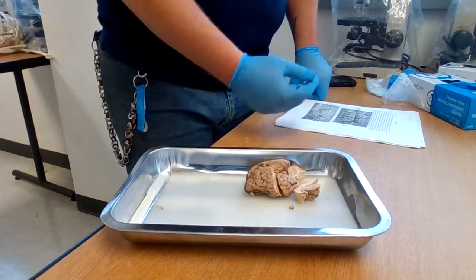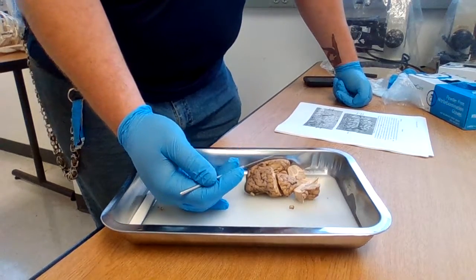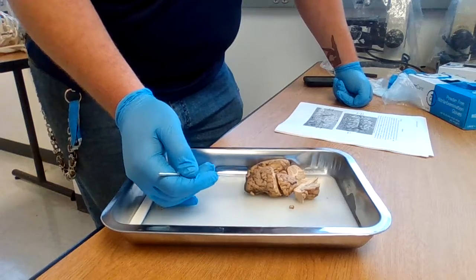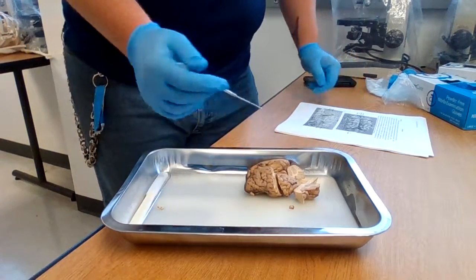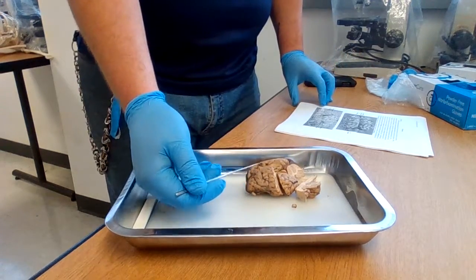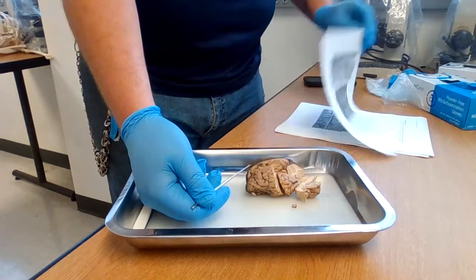Alright, today we're going to be dissecting a sheep brain. For this purpose only, this is going to be the anterior, median is going to be in the middle, caudal. Technically, right now, you're going to be seeing the dorsal, anterior, and posterior.